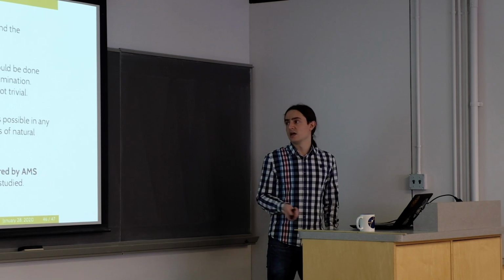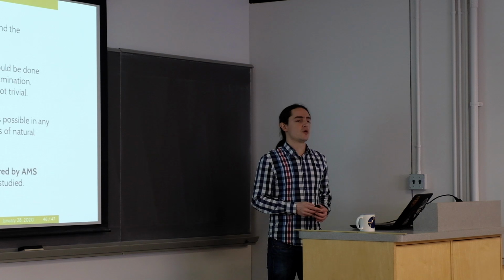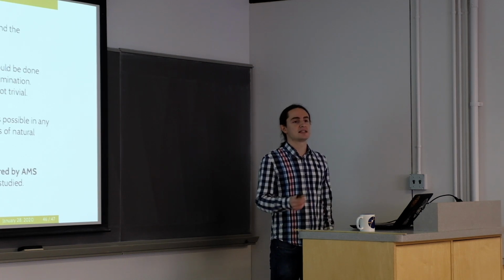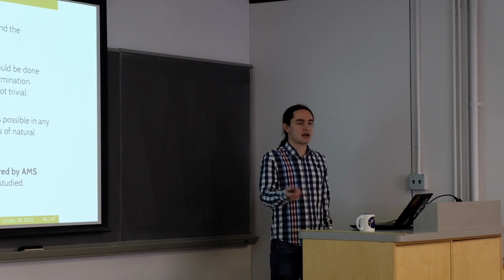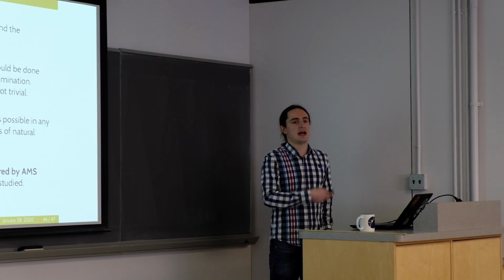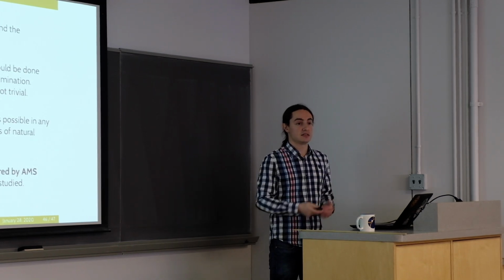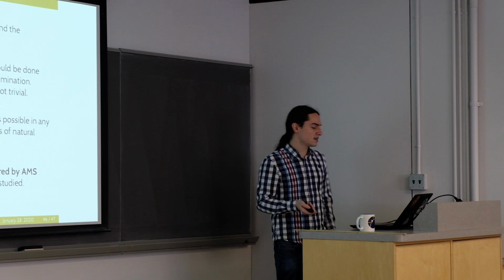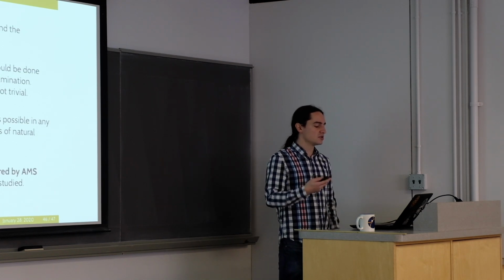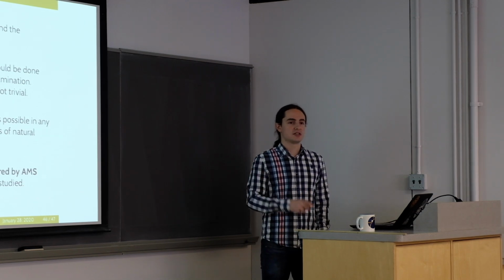We have proved that we have an excellent limit of detection for lead-210, so it's pretty useful when we have just grams of sample available. For example, for Kapton, if you want to have hundreds of grams, you have to purchase a lot of Kapton, because something like this of Kapton is just 3 grams because of the thickness. And we should also totally study the application of common AMS radionuclides to the radioassay.